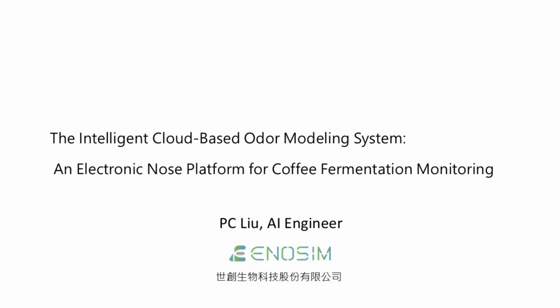Hello everyone, today I am excited to share with you our project titled the Intelligent Cloud-Based Odor Modeling System, an electronic nose platform for coffee fermentation monitoring.